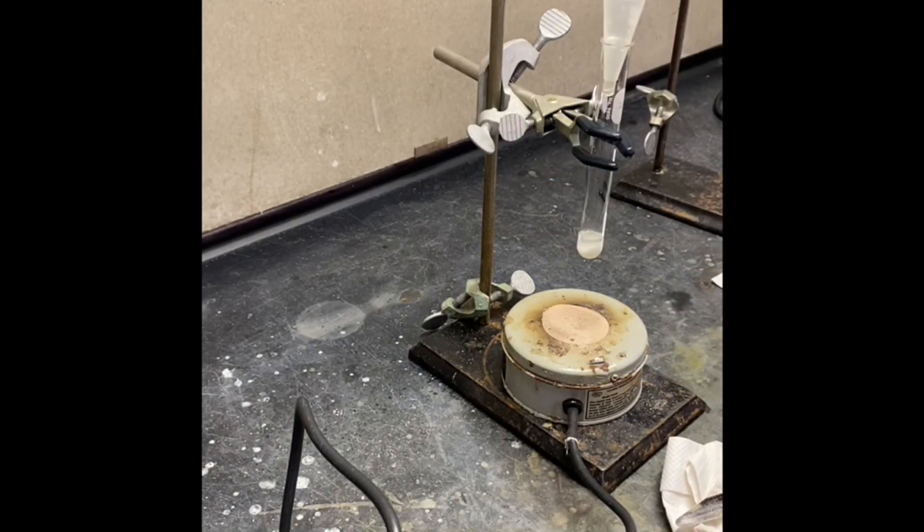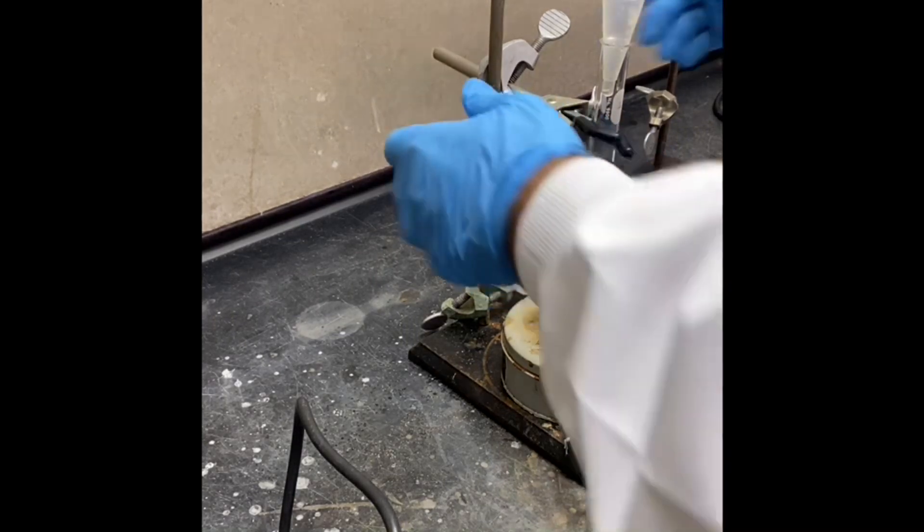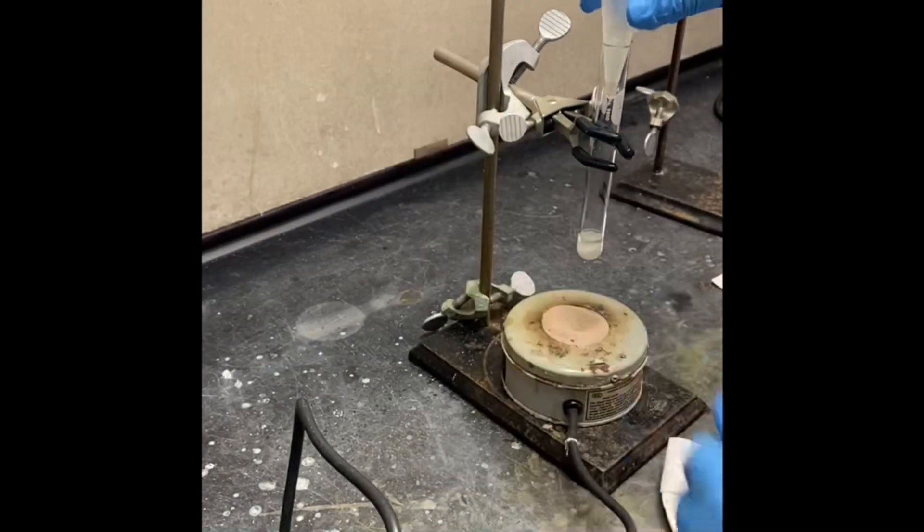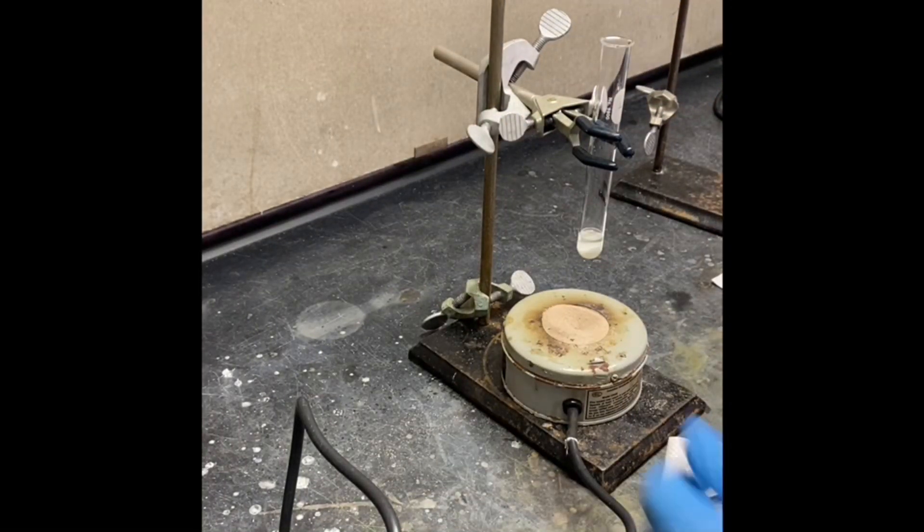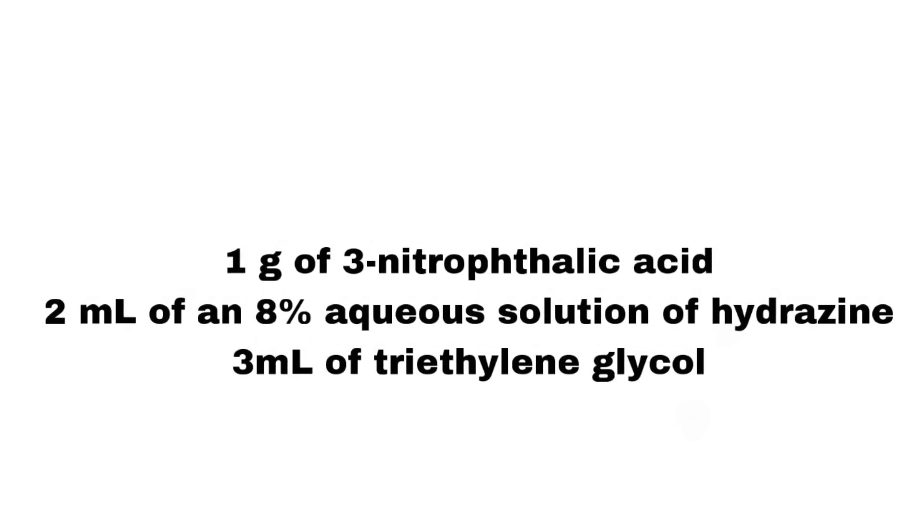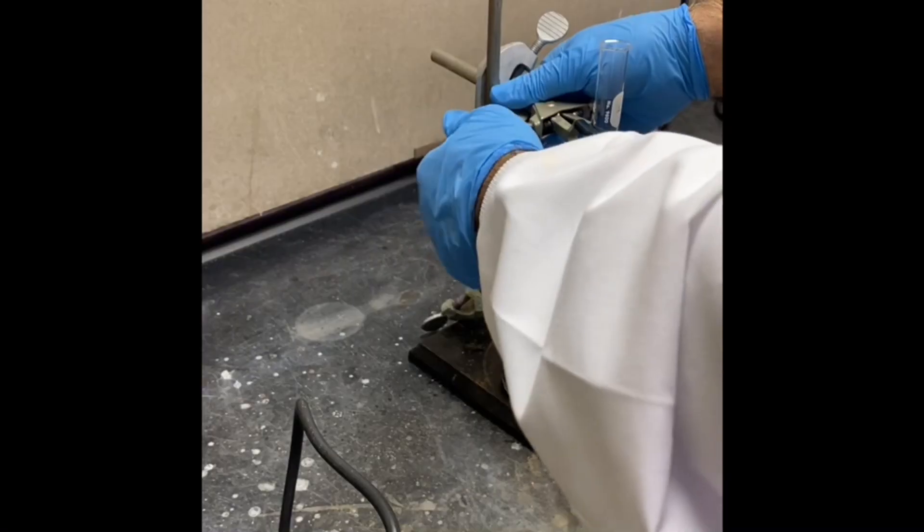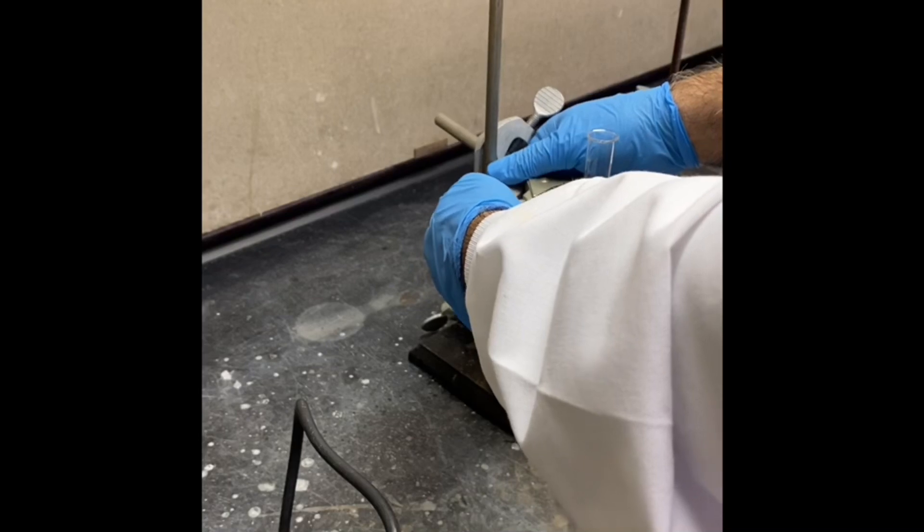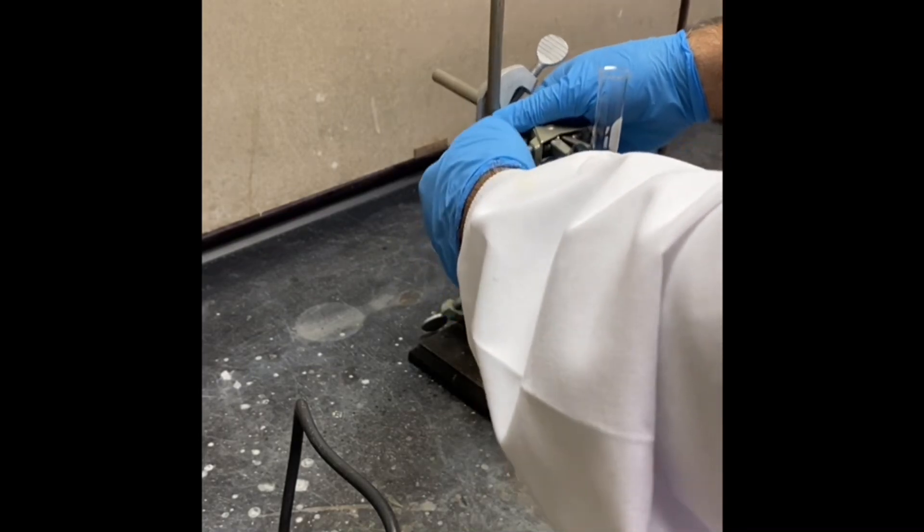Everything is washed down to the reaction flask. Before adding my reaction solvent, which is triethylene glycol, I want to make sure I dissolve the 3-nitrophthalic acid.